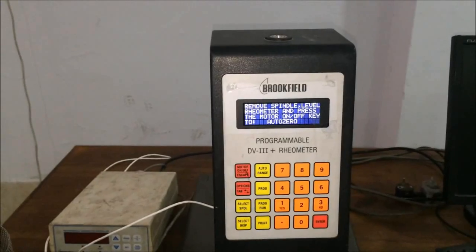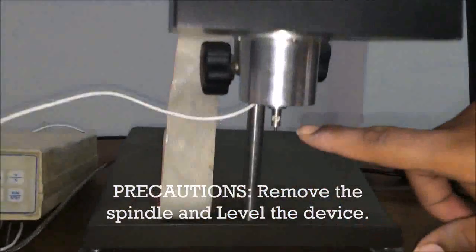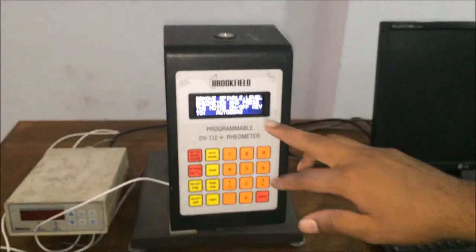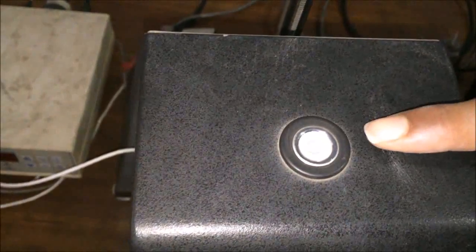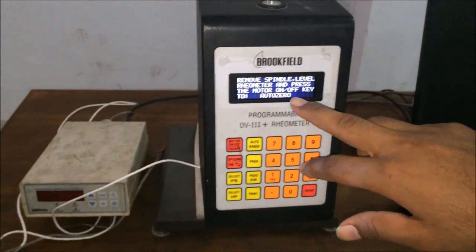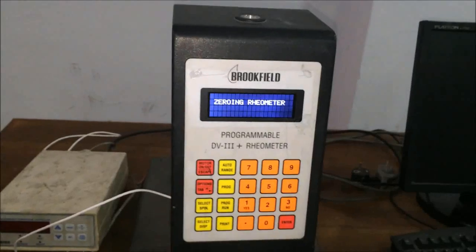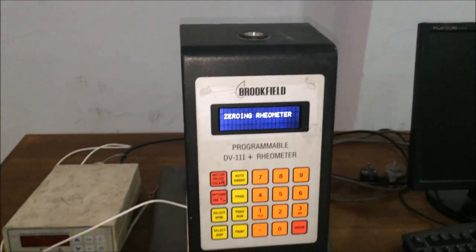The machine is showing us a precaution asking whether the spindle is already removed. We can see the spindle is already removed — this is the nozzle of the motor. The second precaution asks whether the rheometer is level. We can verify this using the bubble-type measuring device. The bubble is at the center, so our apparatus is already leveled. For the third precaution, we will press the function button to auto-zero the motor, setting the rheometer to the zero position.